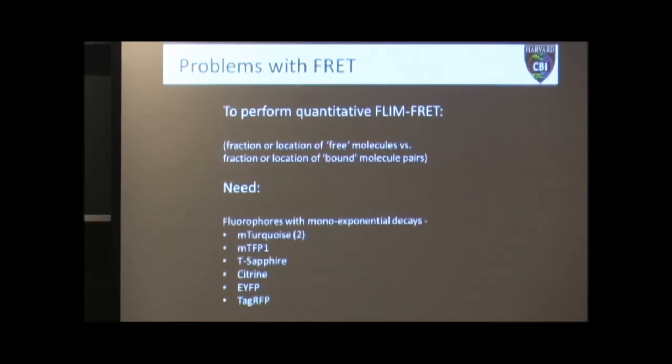So the biggest fluctuation to that lifetime is going to be temperature. So as long as you can get the temperature the same from experiment to experiment, your lifetime should be very consistent. But there is one other thing that can happen. When you're doing quantitative FLIM-FRET measurements, and I'm not going to get into this today, there is actually a way to say how many of my molecules with CFP are bound to a molecule of YFP, how many are free. You can actually make that measurement quantitatively.